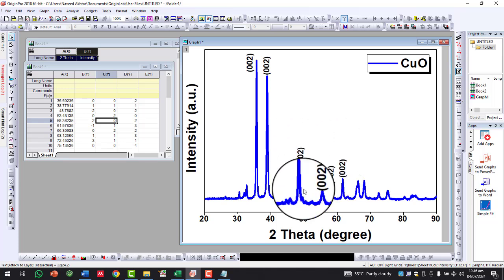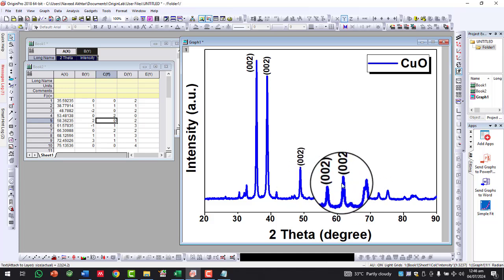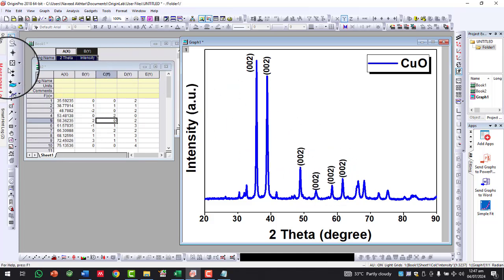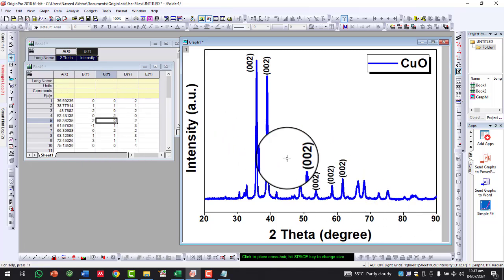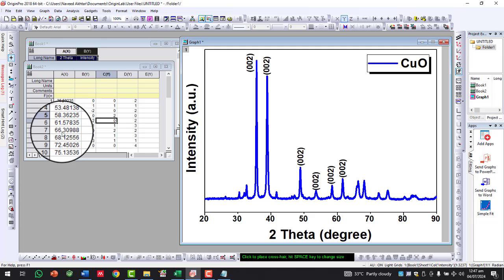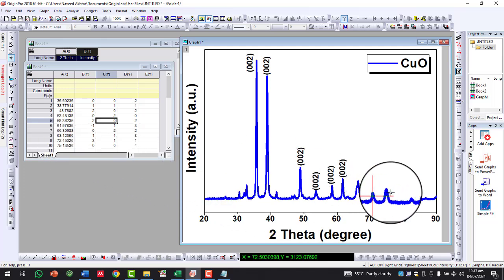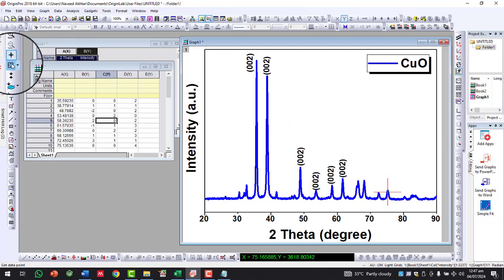That's why I have copied it: by this way I do not need to change the style or size, or make it the same size. So in the last I will perform the changes in the values, so that the respective values of each peak will be changed or put here. Now 66, 68, 72 and 75.